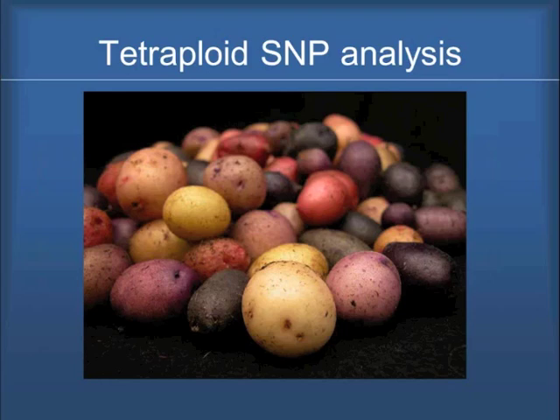So the question has come up about the cost of some software involved. And I think what users have to understand is that you're not locked in to JoinMap, as an example. There are other software packages that can be used in mapping. One of the obstacles is grouping as many markers as you have. So if people aren't going to use JoinMap, they may want to consider creating scaffolds first, grouping those based on what we know about the genome sequence, and then adding markers.